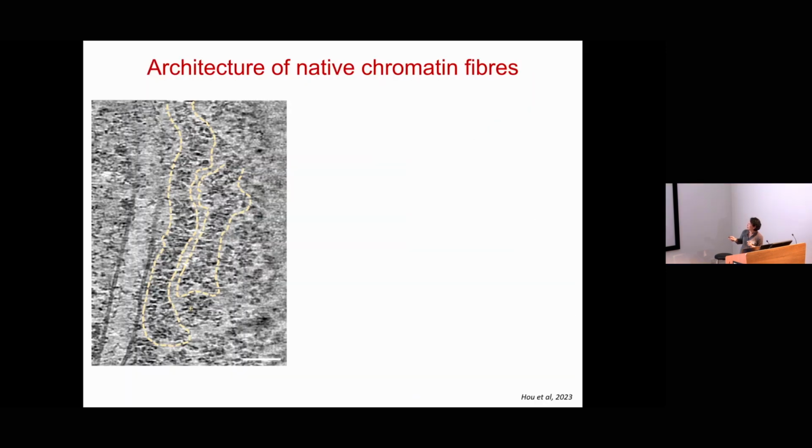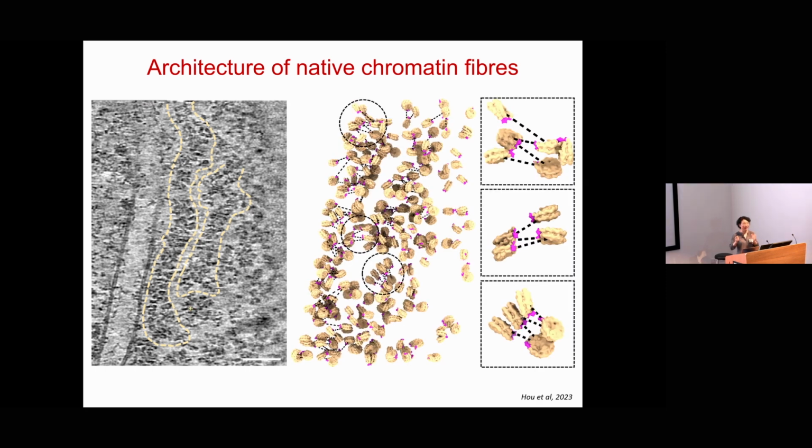Now, we see those nucleosomes beautifully, so we can see how they are connected together. Shown here are 2 fibers, and we can look at each individual nucleosome and connect them because we know where the H1 histone is located. We can link them together, and you can see this is one fiber here, and the next fiber here. We don't see linker DNA. Sometimes we do see it, but not for all of them. And you see how the nucleosomes are linked.